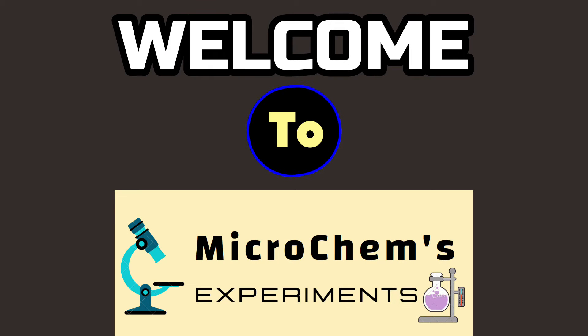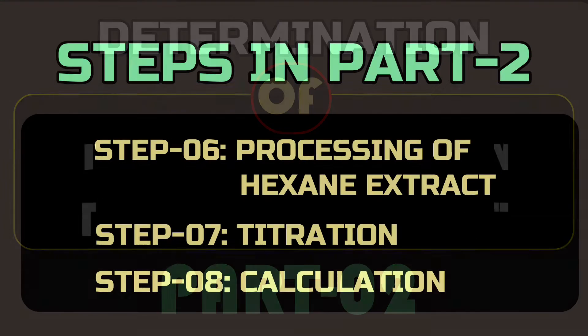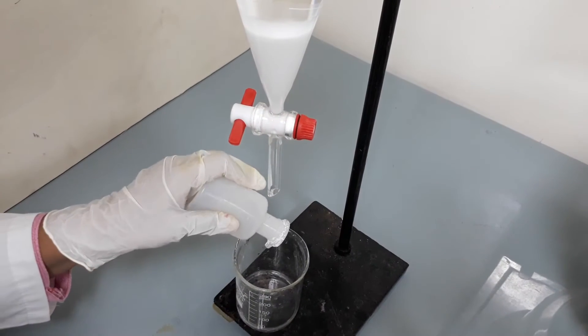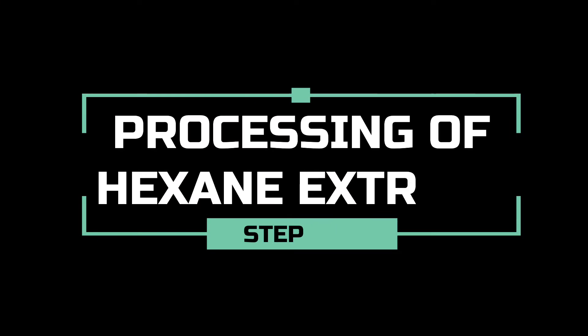This is the second and last video of unsaponifiable matter determination. In this part, we will process the washed hexane extracts, then we will go for the titration. After that, we will calculate the unsaponifiable matter percent. Resuming from the last of part 1, let's start the second part by processing of hexane extracts.